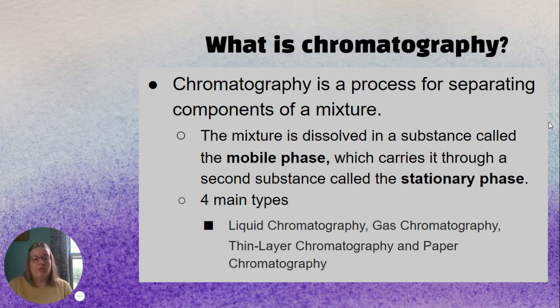Now, paper chromatography is definitely the cheapest of the bunch, which is why we are doing it. We don't exactly have a GC gas chromatography machine just hanging around, but we understand that there are different types besides what we're going to be doing.